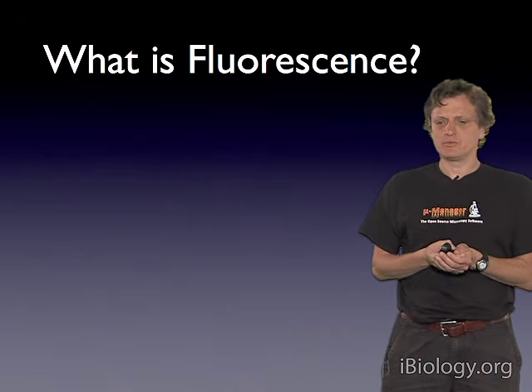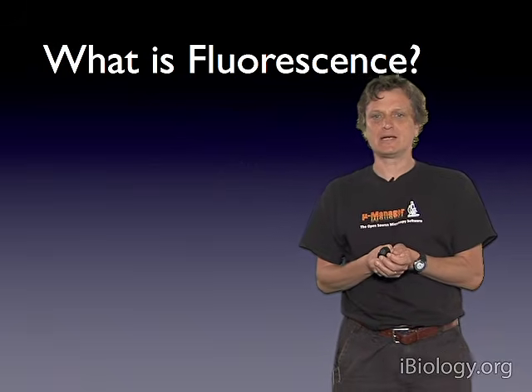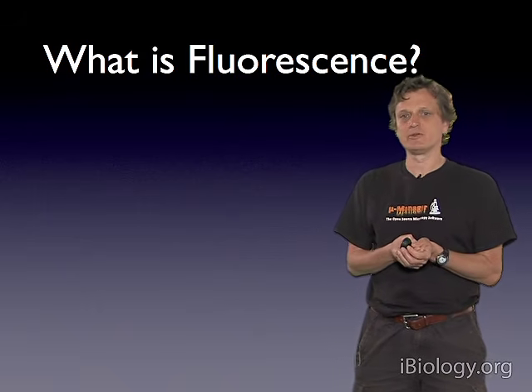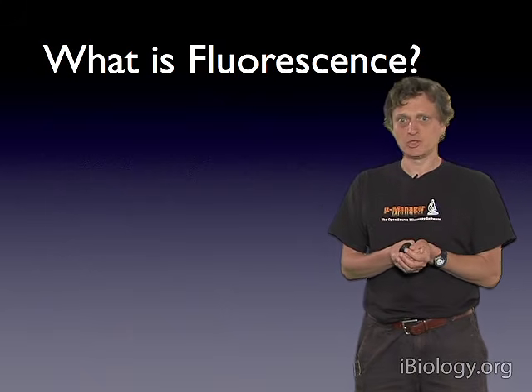So fluorescence is a great thing for microscopy, but what is it really? What's kind of surprising to me still is that humankind has been aware of fluorescence for only about 150 years. One of the first descriptions of fluorescence was by Sir William Herschel.